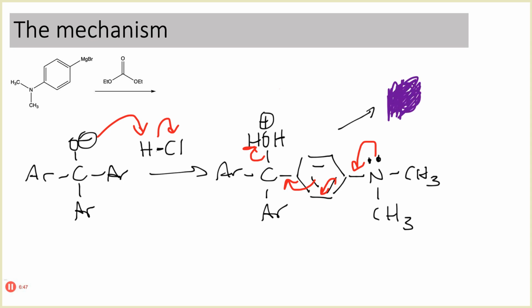There's my purple product. So you can apply that mechanism to methyl benzoate or diethyl carbonate. I'll probably give you an assignment as to which electrophile you will use so you know which mechanism to write up.